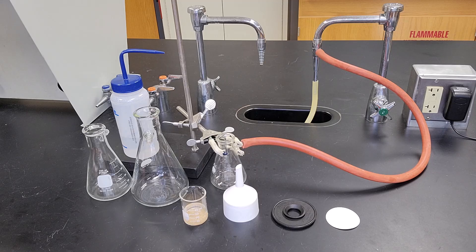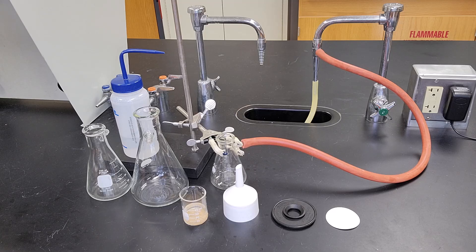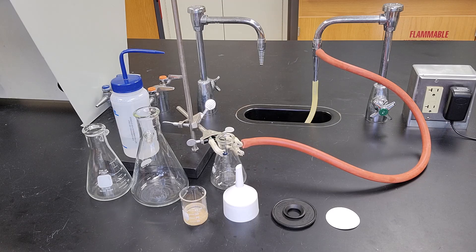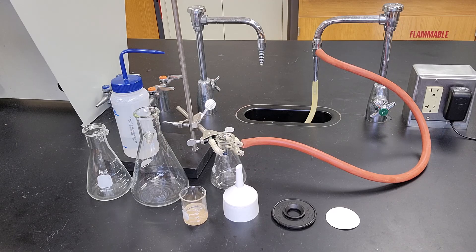and need to filter off the liquid, or if we've crystallized something and need to remove the mother liquor. Vacuum filtration in particular is a very useful skill to have in your organic chemistry toolbox.